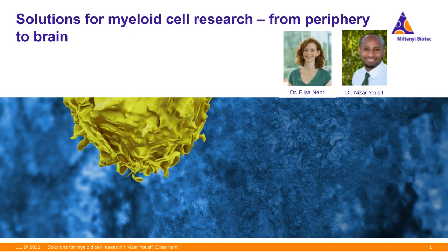But since I guess what you need would be just a small region like the hippocampus, right? And since you have basically less amount of tissue, the workflow or the protocol of the adult brain dissociation kit might be a bit tricky. So here we would recommend a neural tissue dissociation kit because at P8 we don't expect such a huge amount of debris or red blood cells, so you don't really need to do those steps.